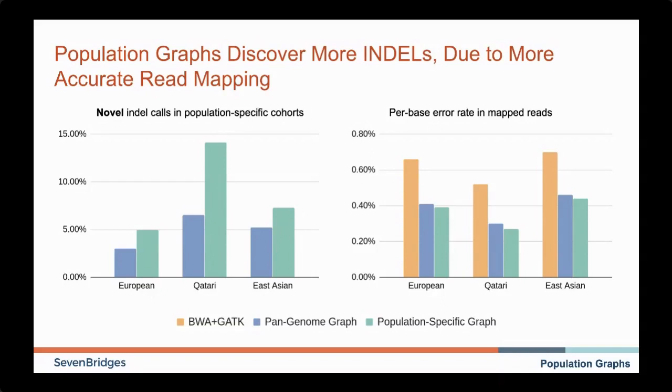on the population that you are seeing right now on the screen, and also on other populations. We tested this on databases such as 1000 Genomes and gnomAD to see if we are covering enough of the genetic diversity of a population so that we provide enough information for our aligner and variant caller.